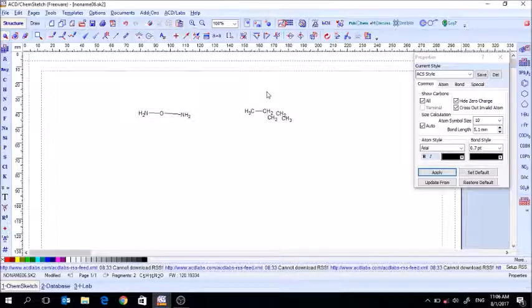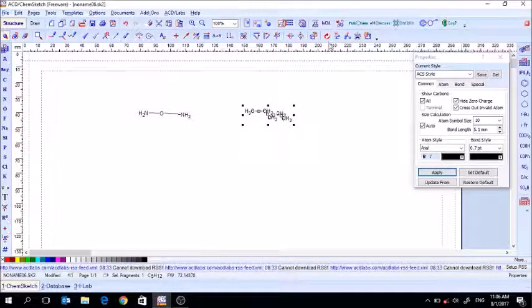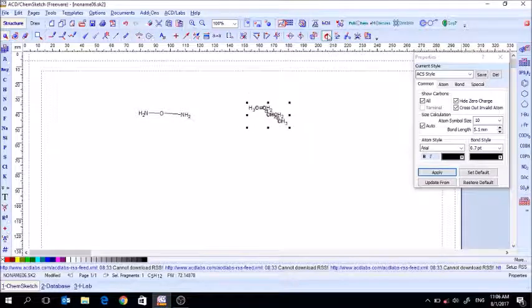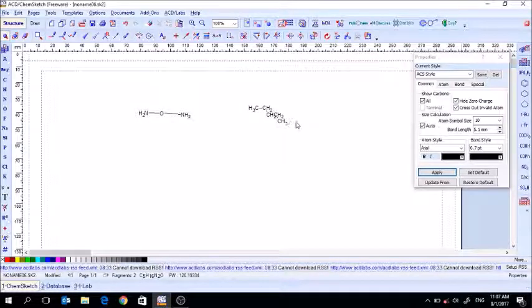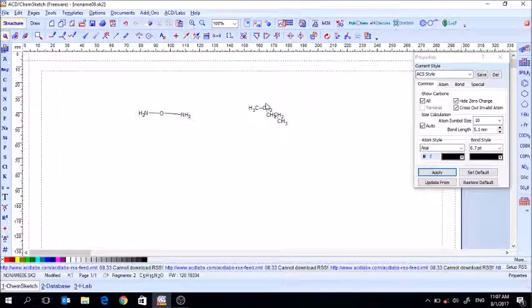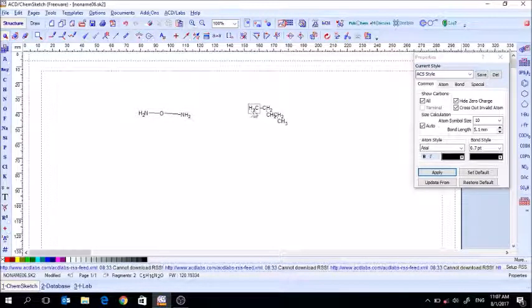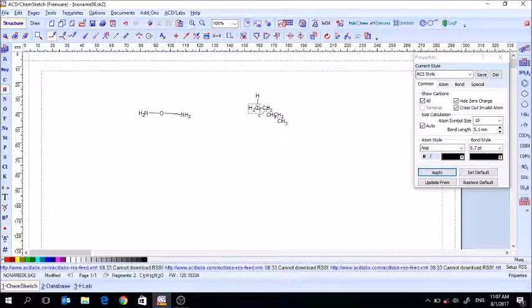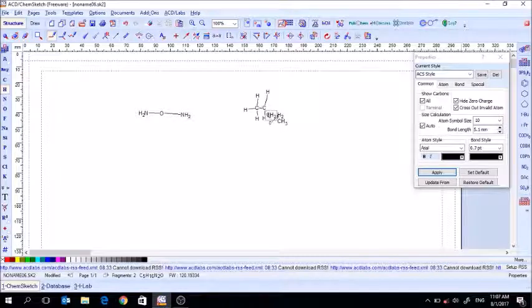Once you show all carbons the structure can look pretty ugly, so select it and hit the Clean Structure button — that straightens it up and makes it more even. You might think it looks like a mess with all those hydrogens. By default they're placed right next to the carbon, but you can click on hydrogen and manually reposition them to look more like what you're accustomed to seeing.